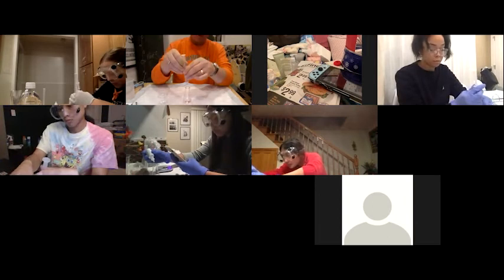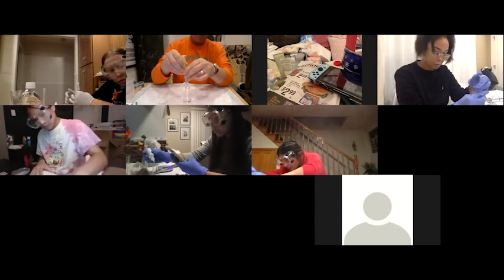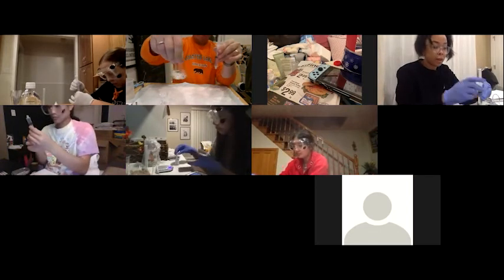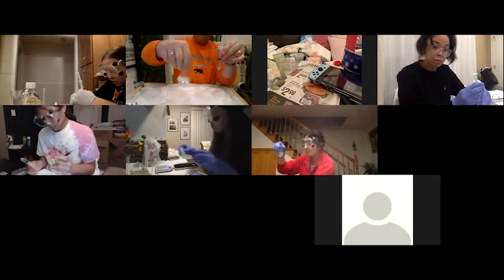Basically, you want to be 1 drop over. And if it's not disappearing, you're done. Not disappearing when swirling, correct? Yeah, then you're finished. But it shouldn't be this really, really bright color. Ooh, I'm getting close now. That one took a little longer.